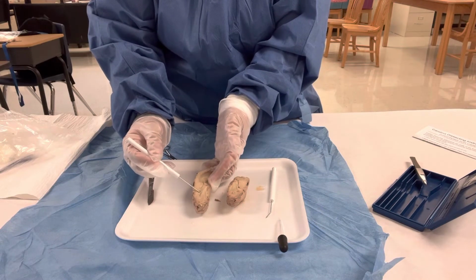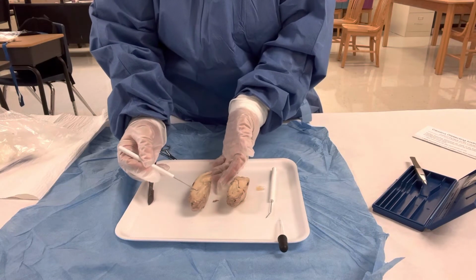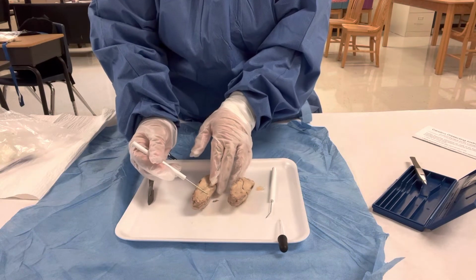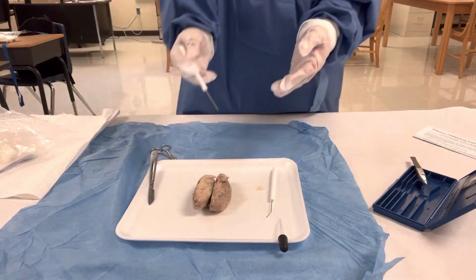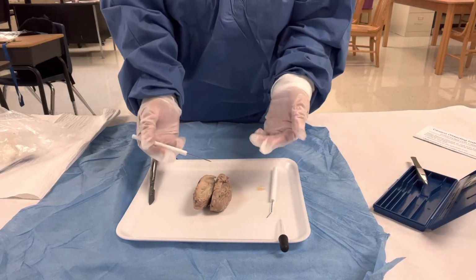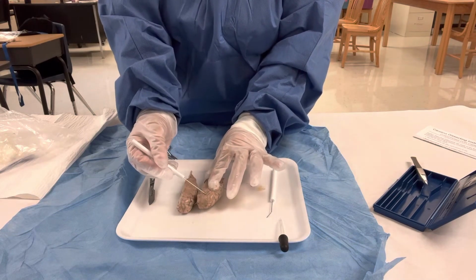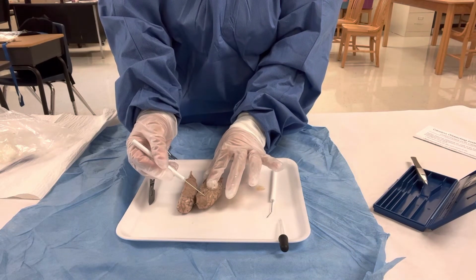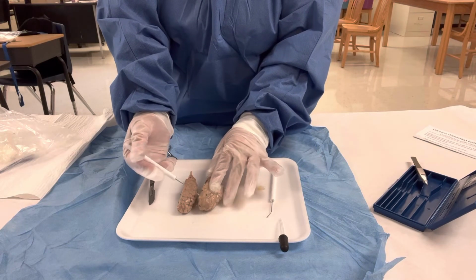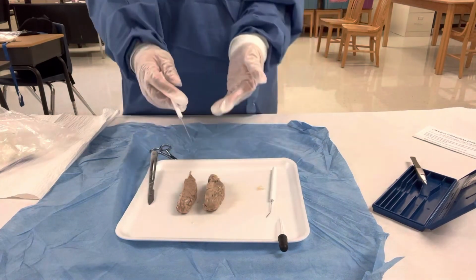I know this is a ventricle, right? The optic chiasm is what I was looking for. It looks like it was right here. This is the two chambers that went together. They're under the brain, the crossing point for the optic nerves. Of course, this is the gyrus, just the folds in the brain, the folds of the cerebral cortex. That's the gyrus.